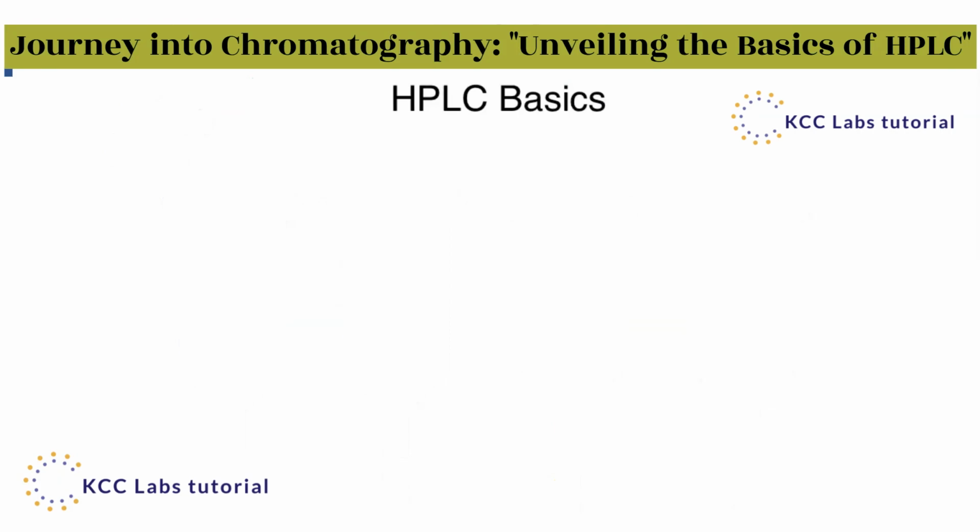Now, in today's more modern labs, we usually have two options when it comes to instrumentation. The first one is gas chromatography, which is GC, and the second one, which we will be talking about, is obviously HPLC. The difference between these is when you want to use GC, you're going to be dealing with things going into a gas phase, but one of the distinctions is that whatever you are putting through the GC needs to be volatile. So whatever compounds you're going to work with have to be volatile compounds.